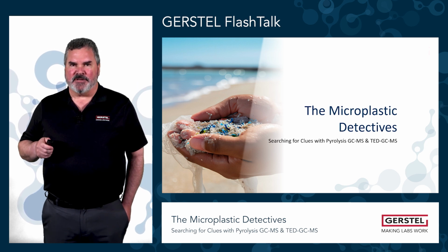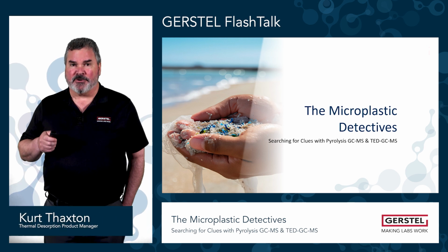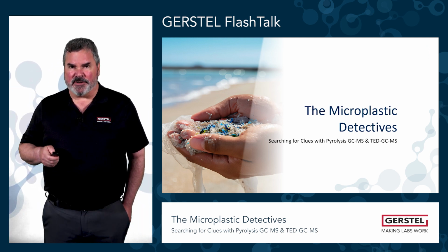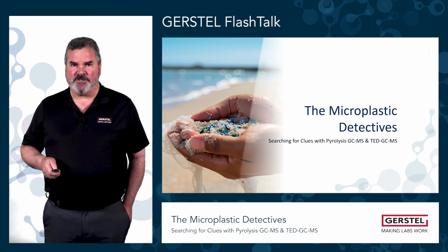Microplastics in the environment is a real problem. It's present in air, water, and soil, but particularly water, where you're most likely to encounter it as a person. So we're going to talk a little bit about how to find microplastics using either Pyrolysis GC-MS or TED-GC-MS.